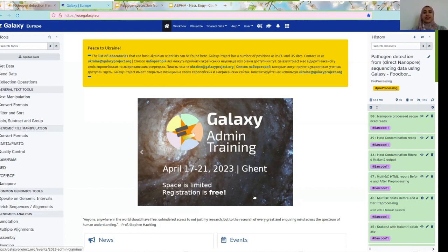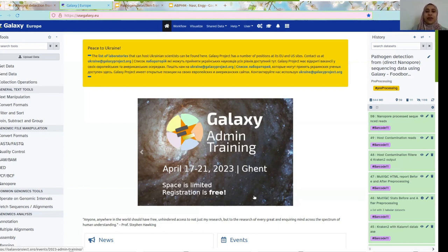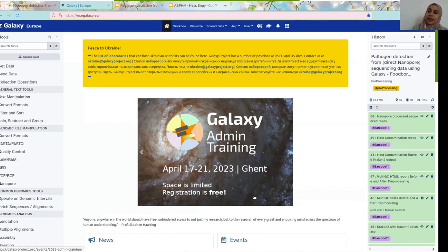Hello, everyone. This is Inge Nosh, a PhD student at the private university in the Galaxy team. Today I'll be guiding you through one of the metagenomics trainings, where we are going to detect and track some of the pathogens — in the example of this training — in food samples.